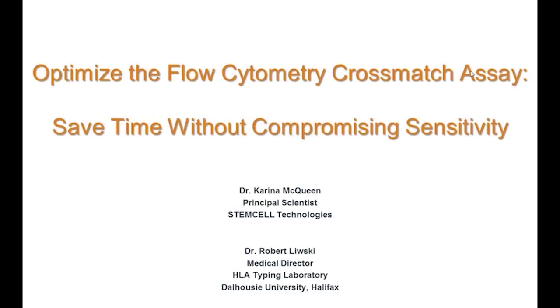Before we pass things over to Dr. Liwski, our own principal scientist, Dr. Karina McQueen, will be providing an introduction to the cell isolation platforms that Stem Cell offers to facilitate highly sensitive flow cytometry crossmatch analyses.